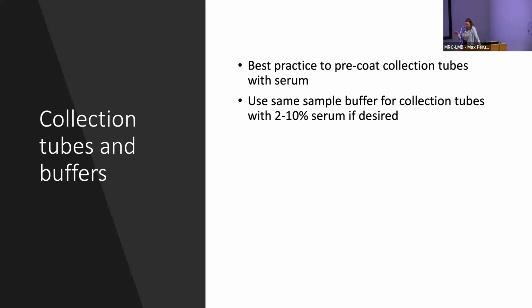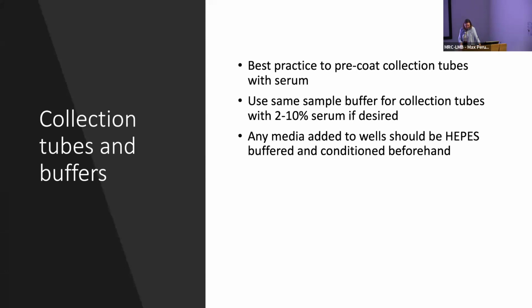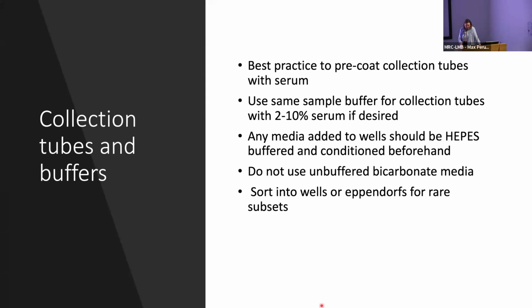The process of sorting cells can actually be quite harsh. You try to mitigate that, but if the cells are landing in a happy, protein-rich environment, it will help them along. Again, any media added to the wells should be HEPES buffered and conditioned beforehand. I already mentioned not to use any unbuffered bicarbonate media.